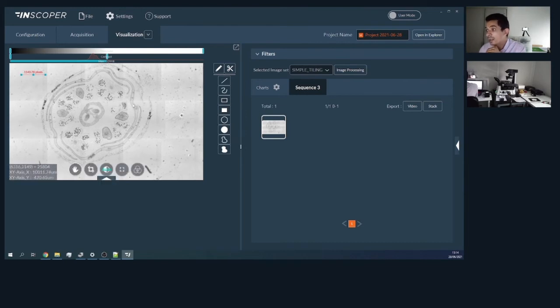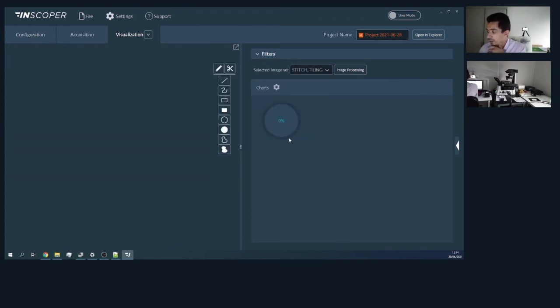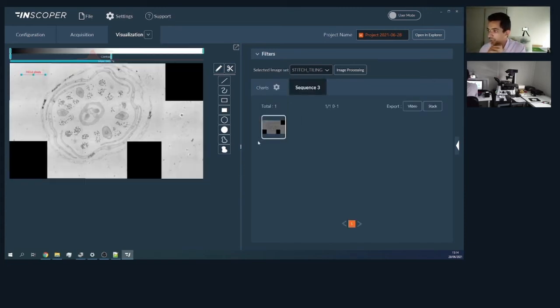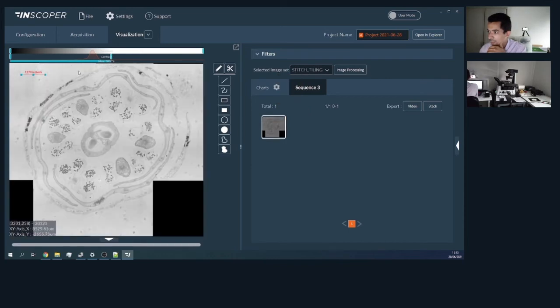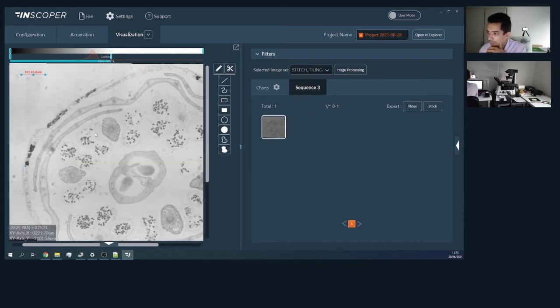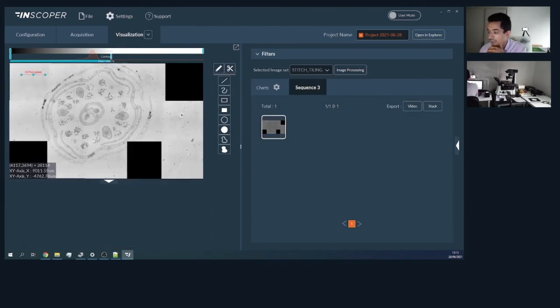What we have also here is a stitching algorithm too. So I can apply it on the first tile with shading correction, in order to be able to compare the image before and after the stitching algorithm. So here, you can see the difference between the two images. So we can see here that the tile is well stitched, and we need in fact to increase, for example here, the intensity of the Brightfield channel in order to be able to get this part too.